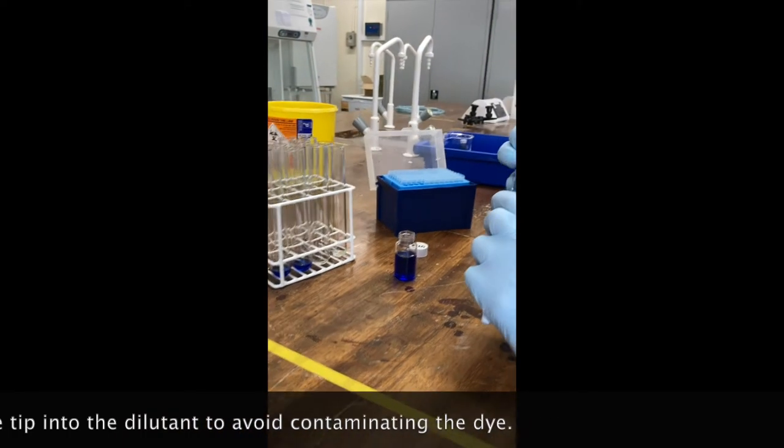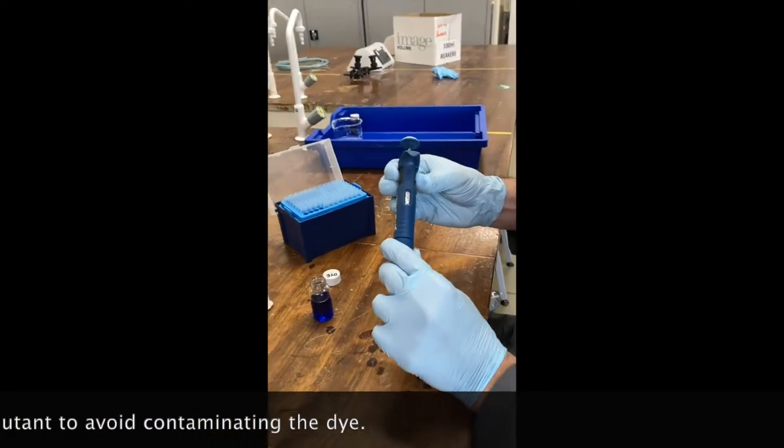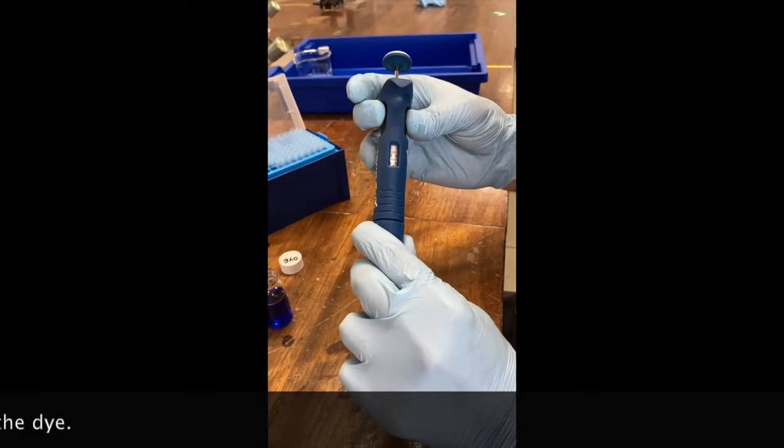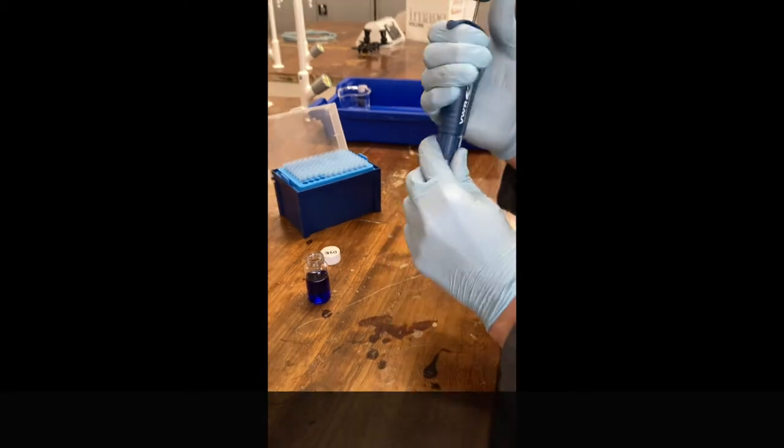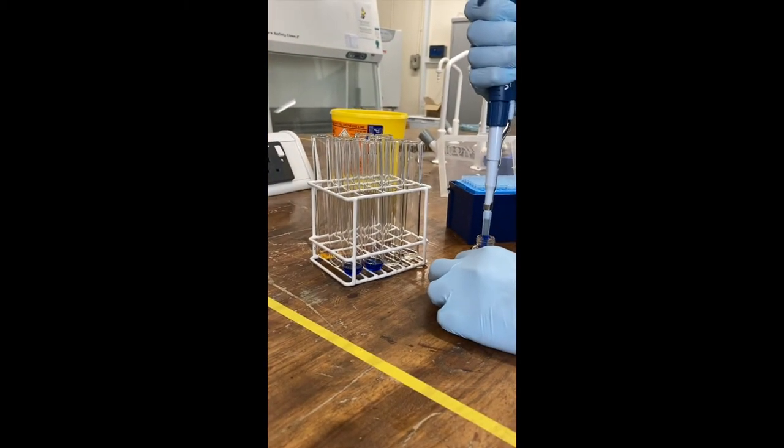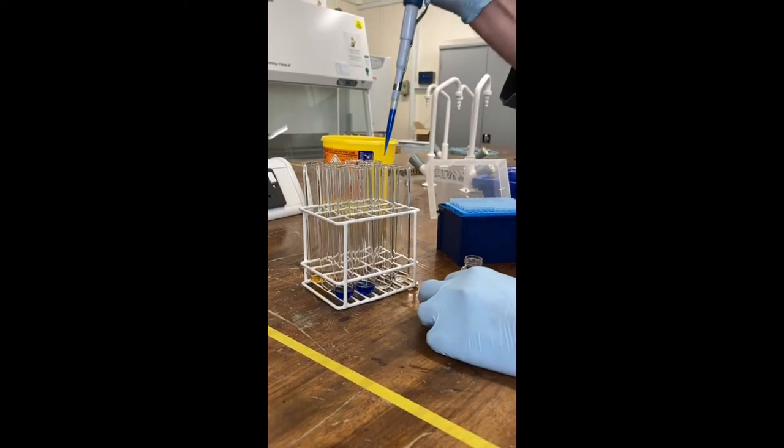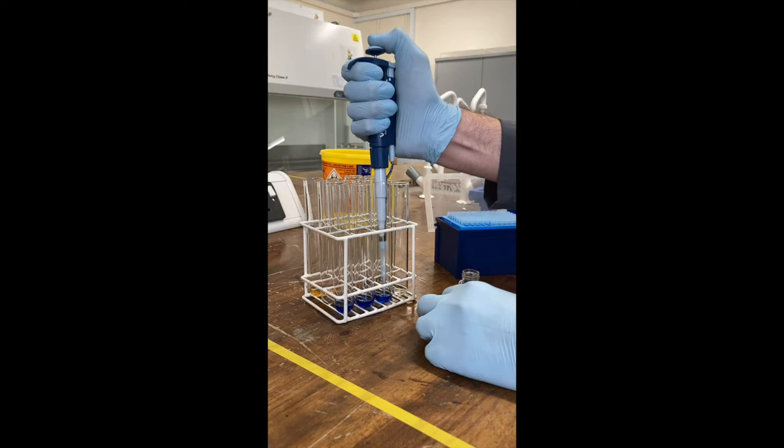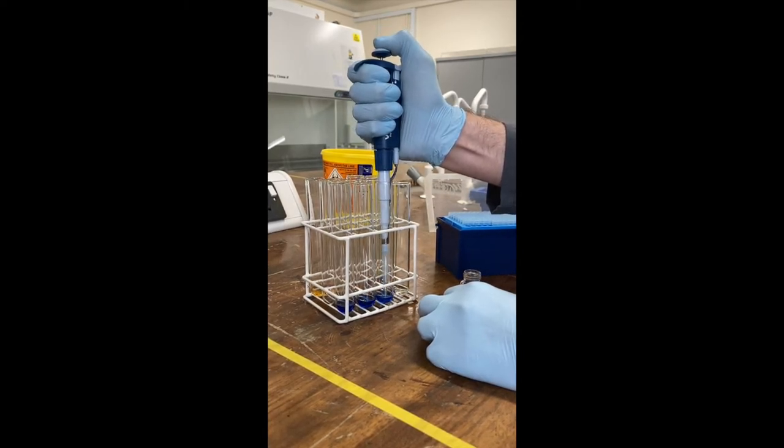For the second tube, I'm going to have one mil of water. So I'm going to need to put one mil of my standard solution in. So that's 1000, which is one mil. Pipette up. And pipette one mil in. Again, going down to the second stop. You want to make sure you mix it carefully.